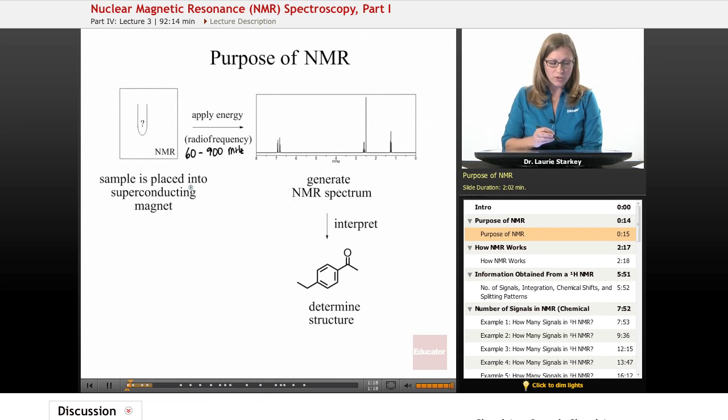So we're going to use radio frequency waves to produce an NMR spectrum, and so this is an example of what a spectrum looks like. We're going to be learning today what are all the details of the spectrum and what can you learn about the structure by looking at a spectrum, and then we're going to learn how to interpret that to come up with an actual molecular structure.